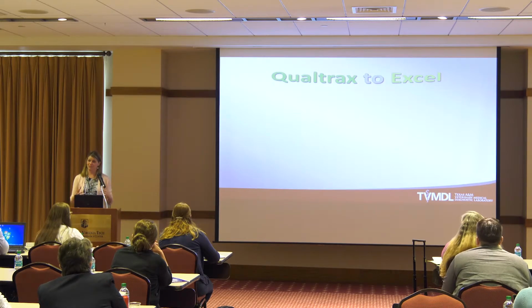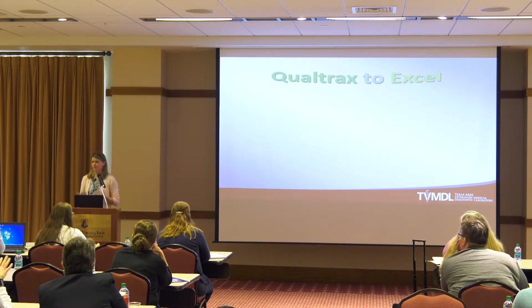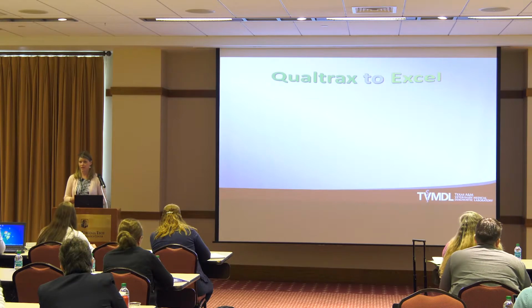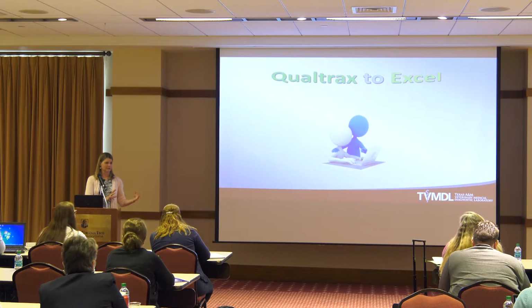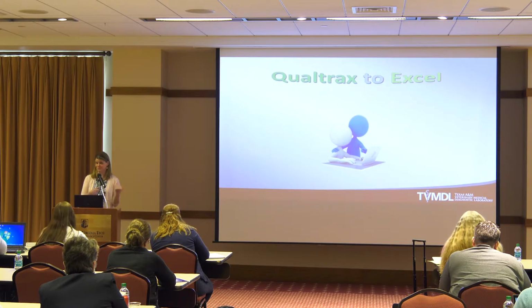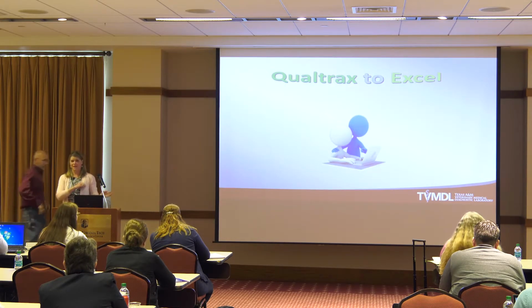But then we had the second piece. As you saw in what Cullyn demonstrated a minute ago, our management likes graphs. They just want to see colorful graphs, and then if they have questions about it, they want us to drill down, and we have it set up so that we can actually drill down, get case numbers, get workflow numbers, and then go back to Qualtrax and get those details. So now we have to get it out of Qualtrax, put it in Excel, and make it look the way that our management wanted it to look before we transferred. Cullyn is our resident Excel expert, so he's going to show you how we created the reports and how we get into Excel.